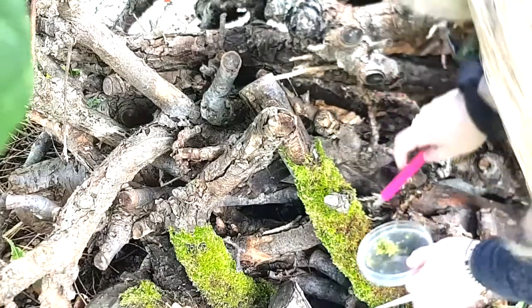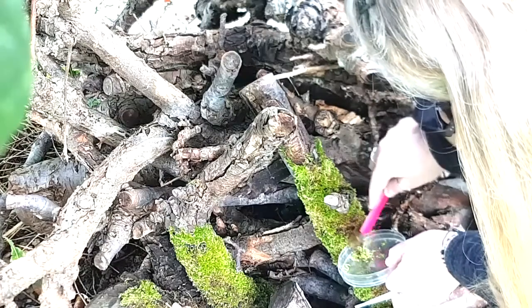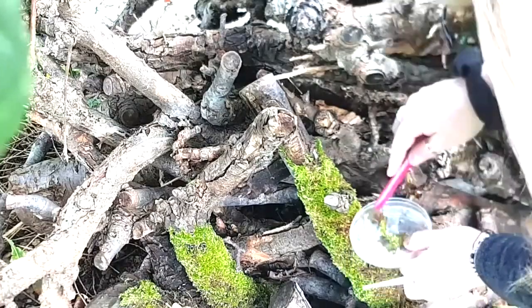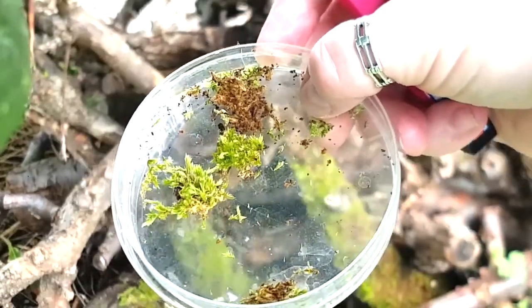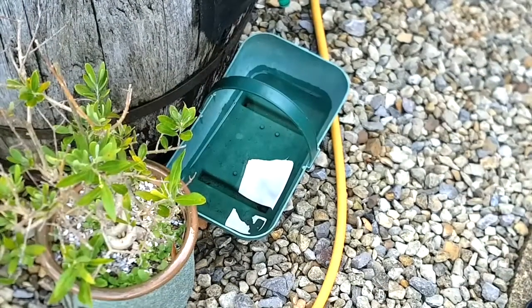A little bit more in here. There we go, so you can see we've got quite a bit of moss there. That's probably plenty for us to use for now. Okay, the next step is really important.